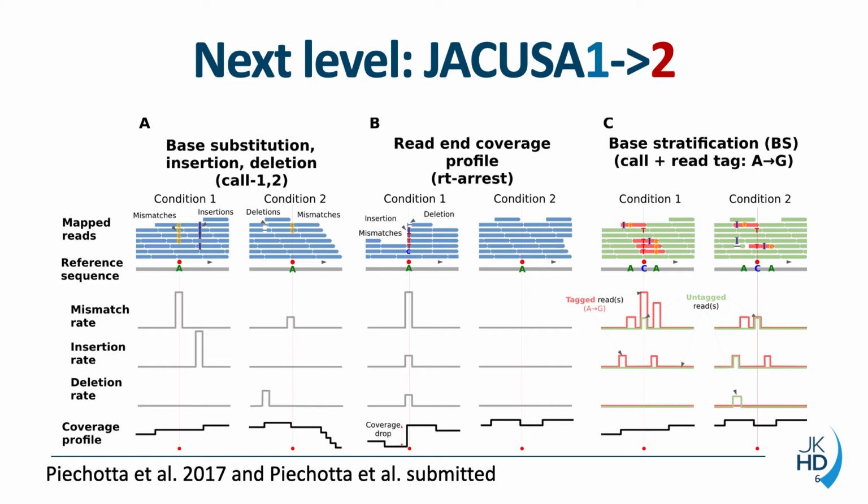And that could be used, for example, for metabolic labeling experiments where characteristic changes are brought about, and they could then be contrasted over two conditions, whether they are changing dependent on the modification status and whether we are looking at a newly synthesized RNA, for example.